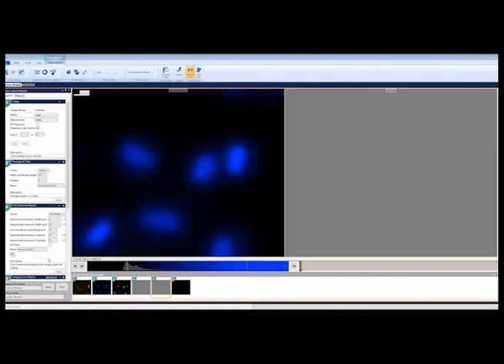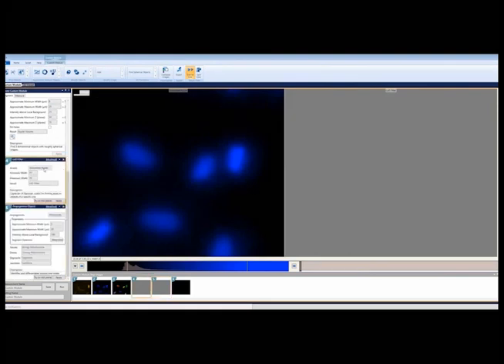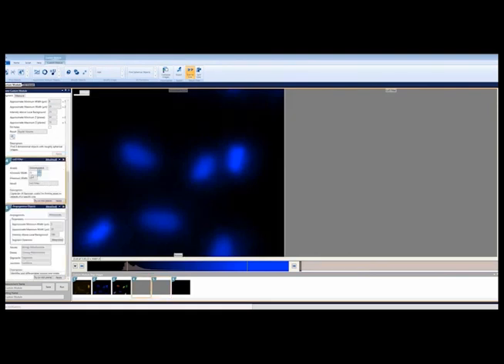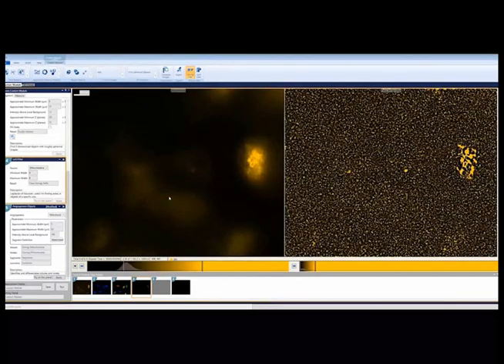Before we run angiogenesis, though, we will add a pre-processing step. We want to separate and highlight relatively small structures from blur or smear. The LOG filter, or Laplacian of a Gaussian filter, is a great tool for this. With LOG used to highlight the mitochondria, it is time to run angiogenesis.